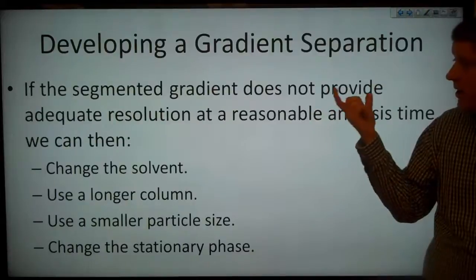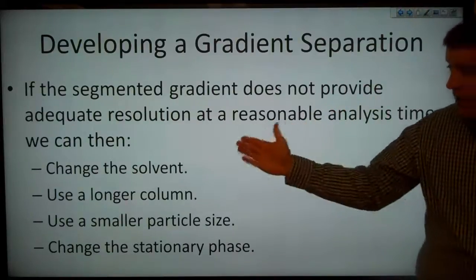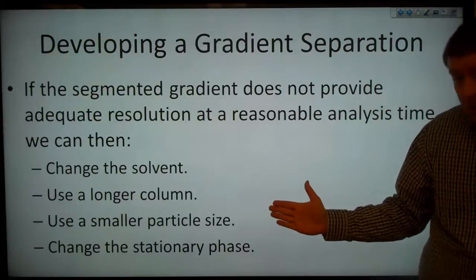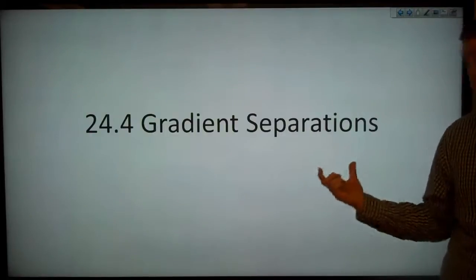If the segmented gradient does not provide adequate resolution at a reasonable analysis time, we can then change the solvent, use a longer column, use a smaller particle size, or change the stationary phase. And that was gradient separations.